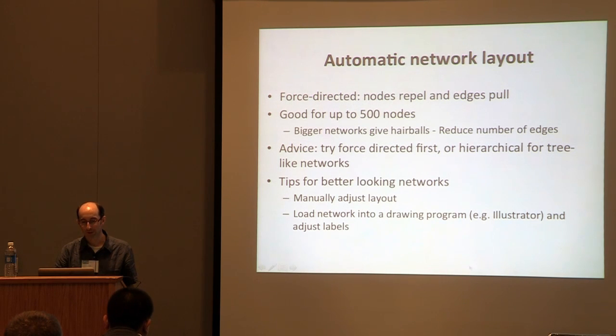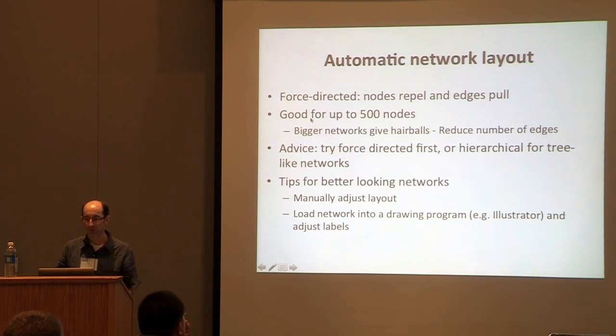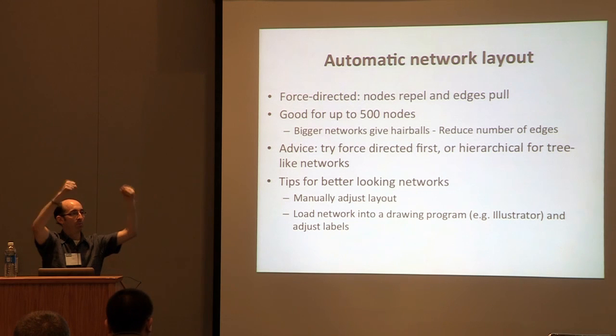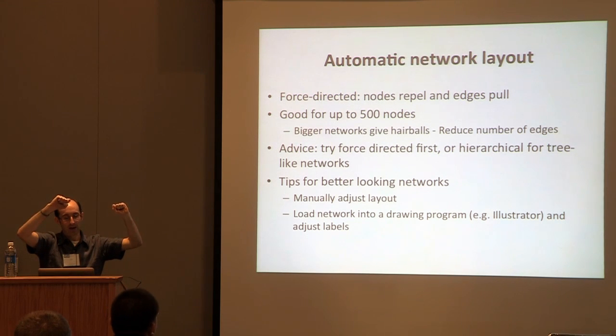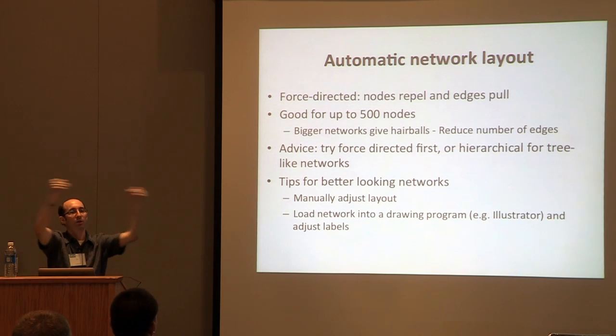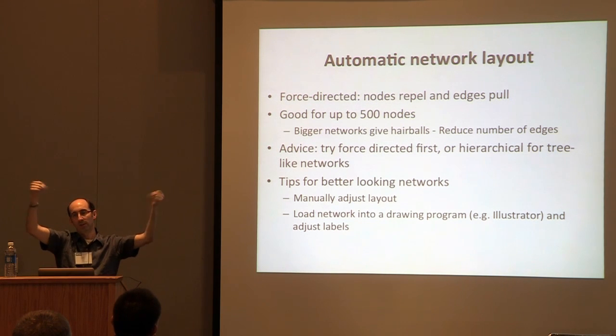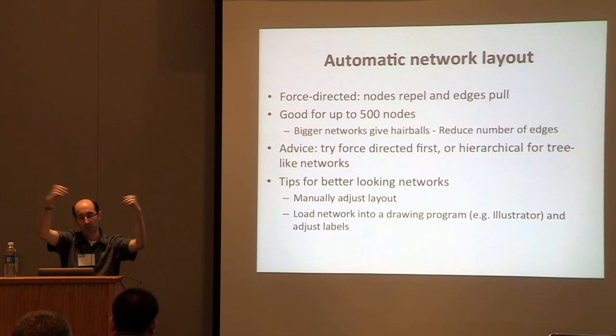The most popular type of network layout, the most general one that most people use, is called a force-directed network. It tries to simulate the network as a physical system where nodes are repelling each other, maybe like charges that repel each other in physics. And the edges are pulling the nodes together. They're providing some force that's pulling nodes together, maybe represented as springs or some other way.